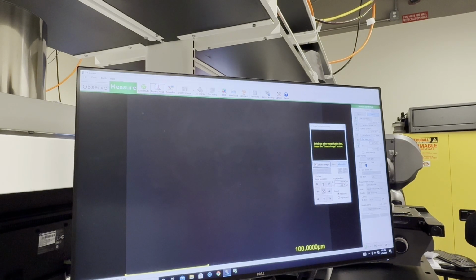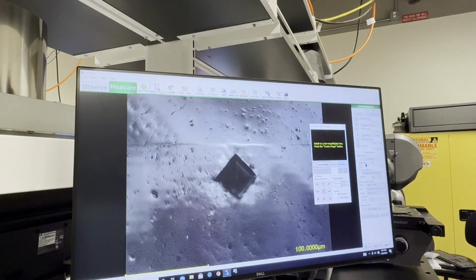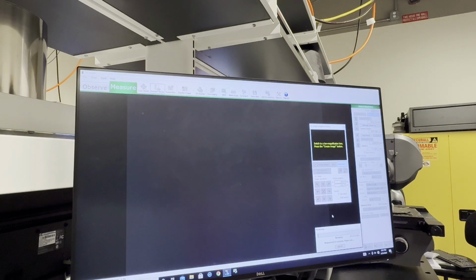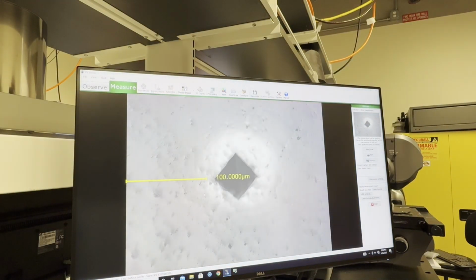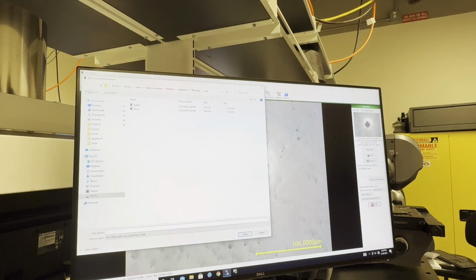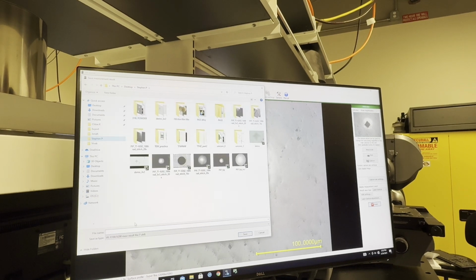To take a 3D image, you want to move the lens up and down. When you're doing this, you want to make sure to get the material in complete darkness, as this will increment the laser up and down from the top surface to the bottom surface that you set the position in. We skipped over the process of the image incrementing the laser and stitching it together. But after we've done that, you'll want to click Finish, read the prompt, and click Yes.